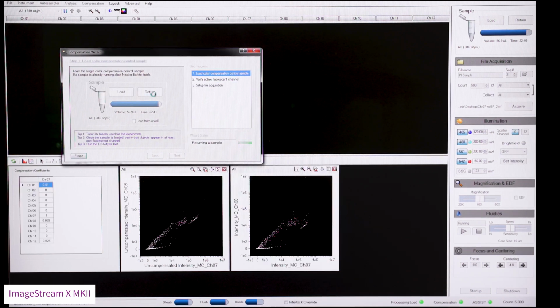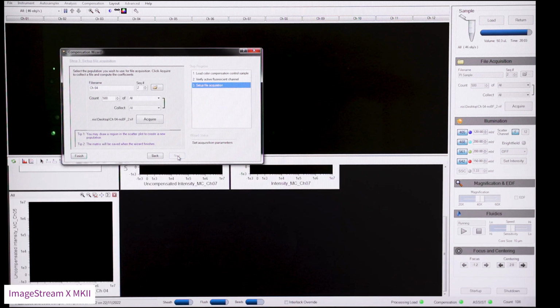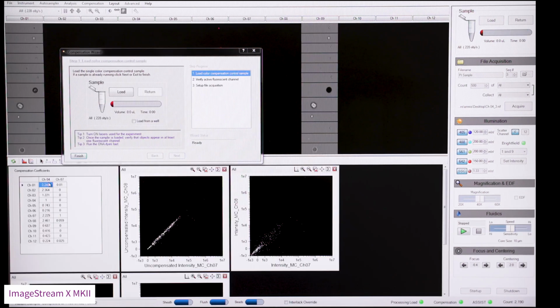Return the sample and load the next control sample to repeat the process. In this case, it has got the wrong channel, so I'm going to correct it and tell it that our PE eFluor 610 will be best in channel 4. Press Next and Acquire. Return that sample and you can see now that it has calculated the compensation coefficients for channel 4 into all the other channels and channel 7 into all the other channels. Press Finish and save the compensation matrix.